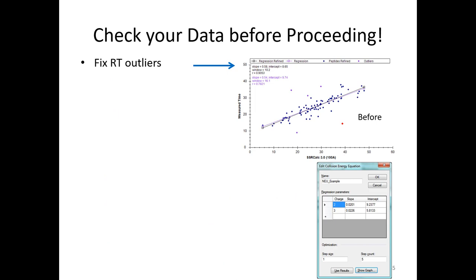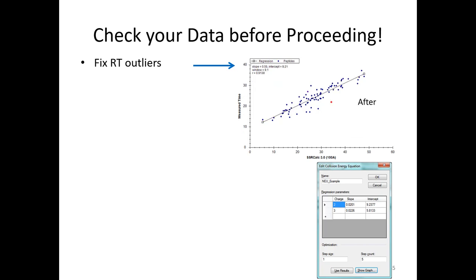Okay, so it's important if you're doing this process to fix your outliers, because if you have peptides that are out here and Skyline didn't pick the right ones, or not the one you would pick, or even these outliers, then that takes those into account, particularly if you have a bunch down on one side or ones that weren't picked by Skyline. You'll want to fix those ahead of time, because that'll change the slope of the regression. So you see the difference?